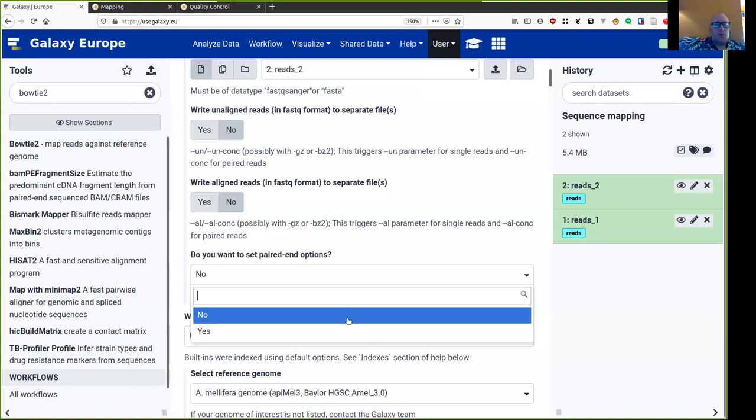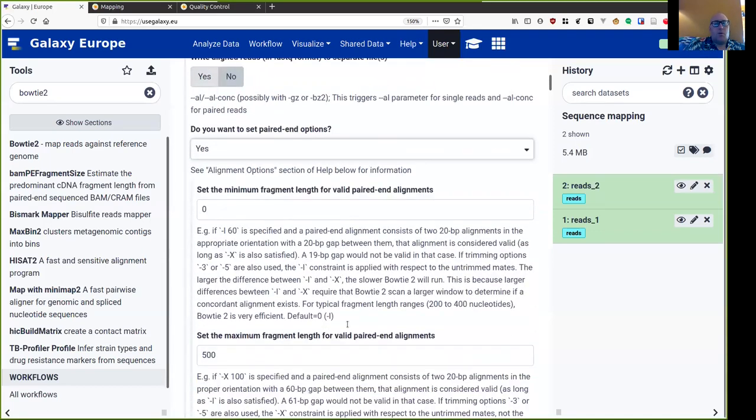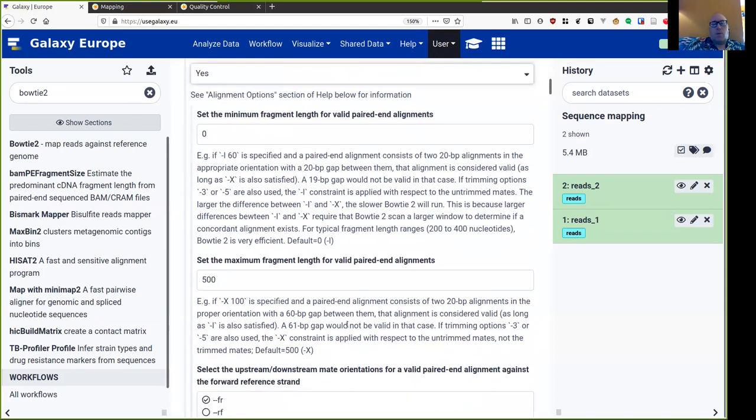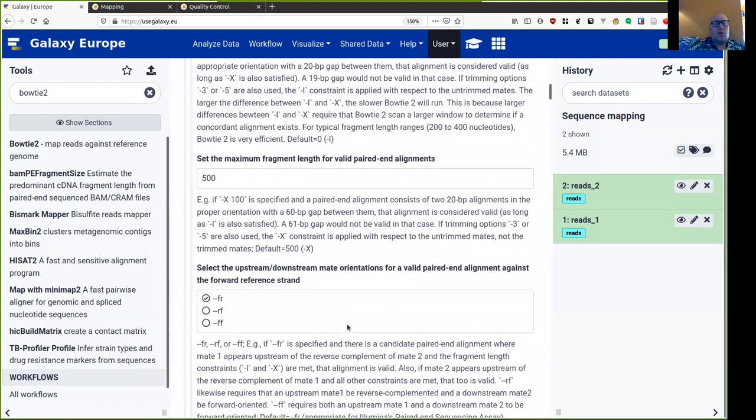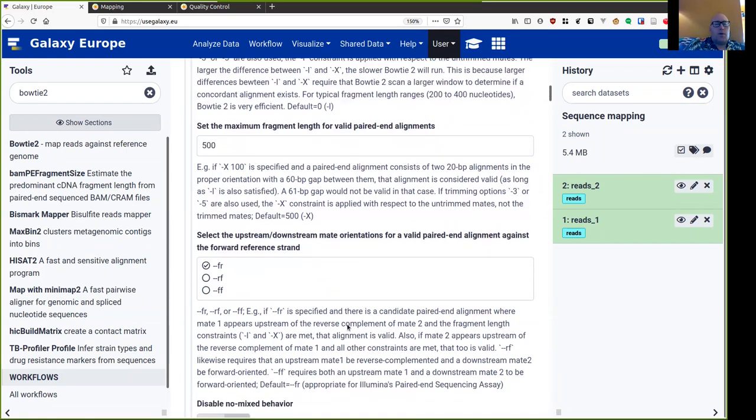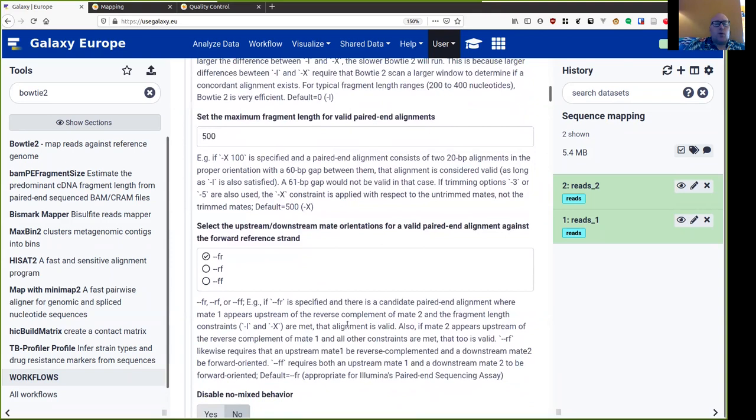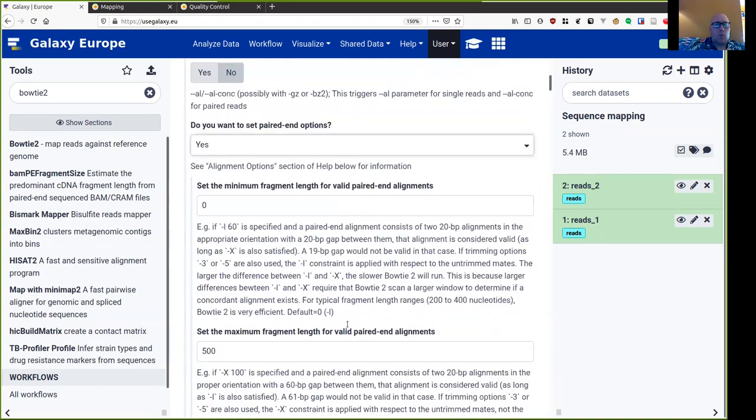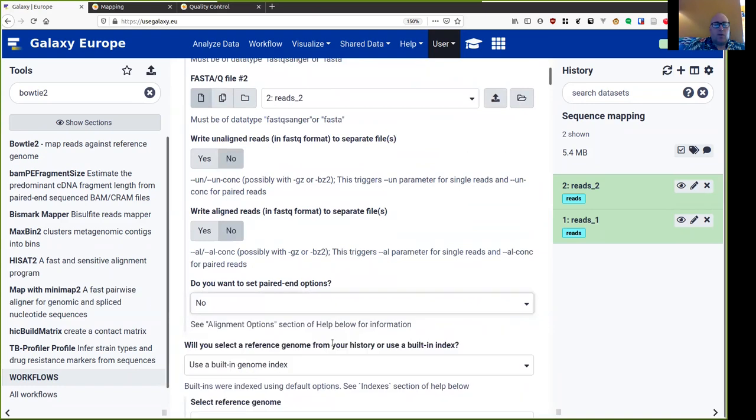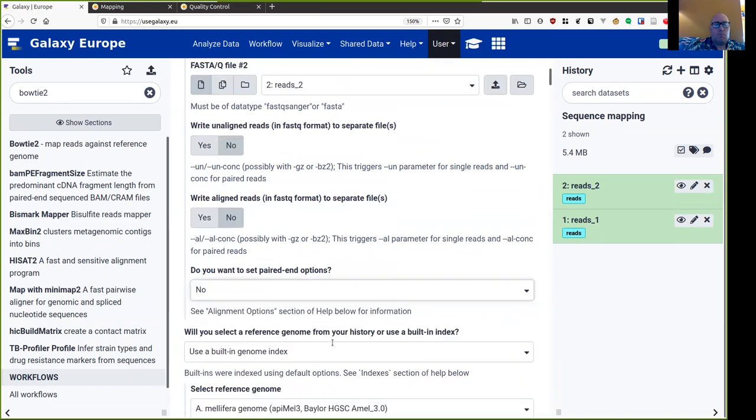And then it asks us some questions about paired end options. So let's have a look at these paired end options. The minimum and the maximum fragment length. Remember that paired end reads come from either side of a fragment of DNA. So we could guide the mapper by specifying how large we expect that fragment of DNA to be. I'm going to leave these at the defaults. Then the upstream downstream mate orientation. Do we know if the read one is forward and read two is reverse and so on? Well, this is something that we'll know from library construction time. We don't know with these reads. So I'm going to leave this option off. But if we do have this information, it can make mapping a little bit more accurate.